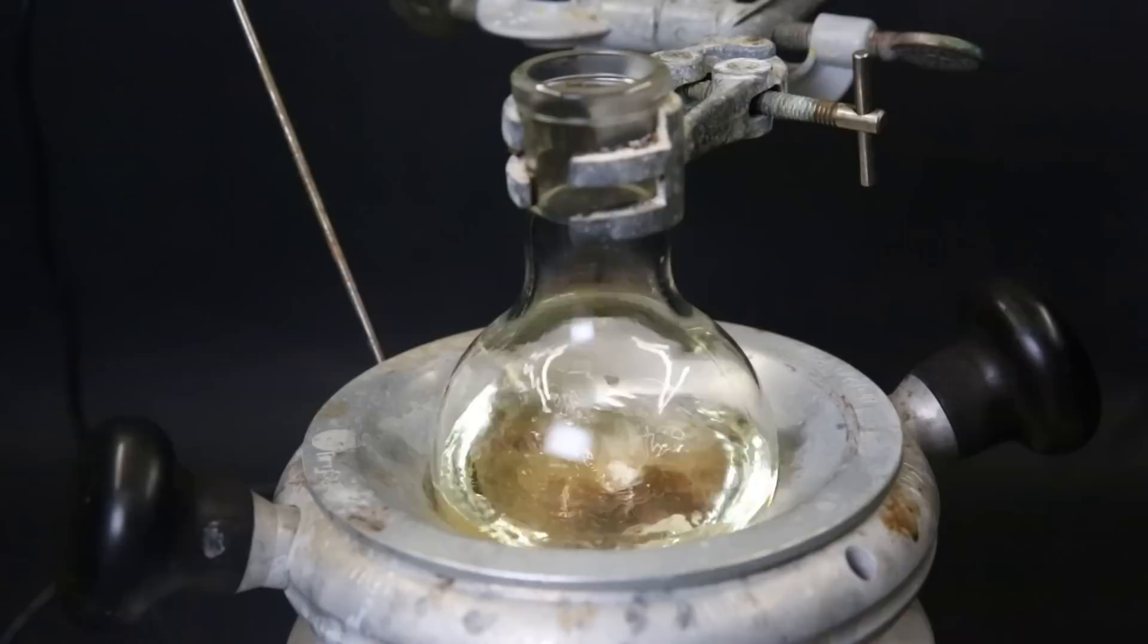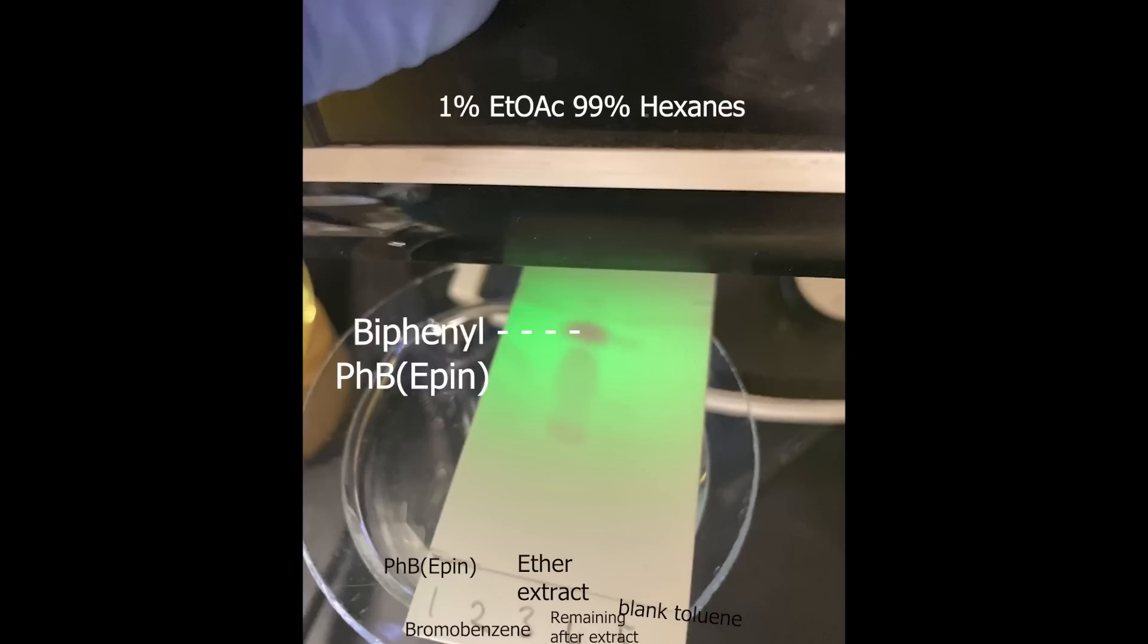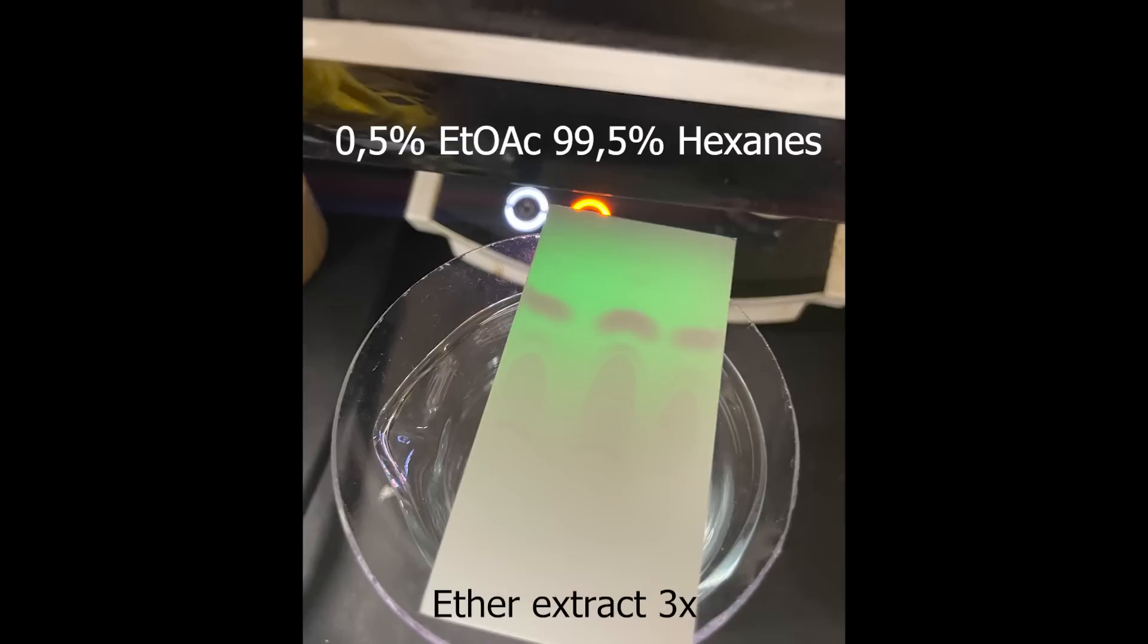I also took some TLCs of the ether extract to see what is in there. As expected, there is still phenyl B-epin present, but we also see a big spot at the top, which should be biphenyl. I also tested the ether extract with only 0.5% ethyl acetate, and I actually like this separation more. Since these compounds can't really be separated properly in any other way, I will have to do another column. After all the ether has been boiled off, a yellow liquid remains.